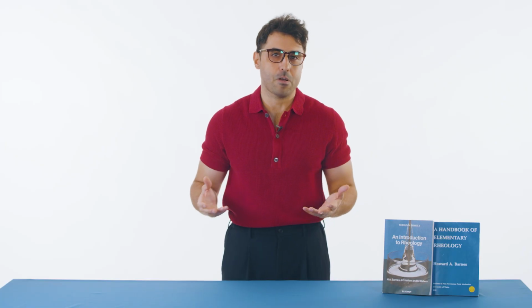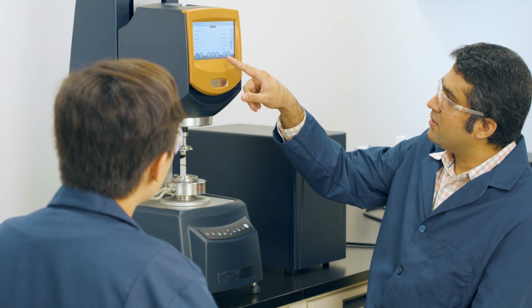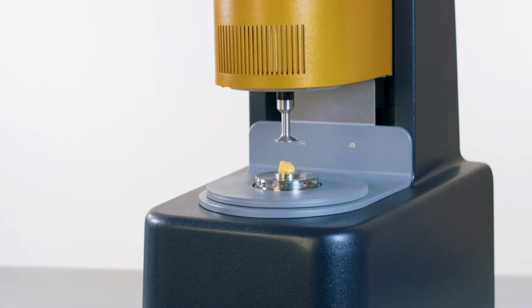This is episode 2, and today we are diving into a really exciting question. Now that we understand what viscoelasticity is, how do we actually measure it? Spoiler alert, a viscometer won't cut it. To measure viscoelasticity, we need a more advanced and powerful tool, the rheometer.